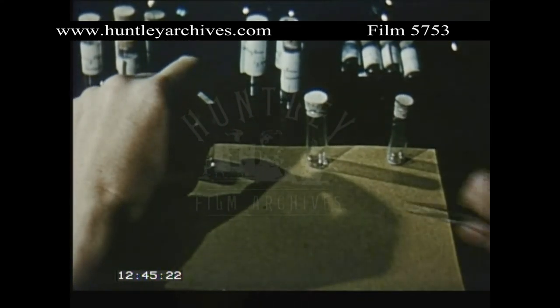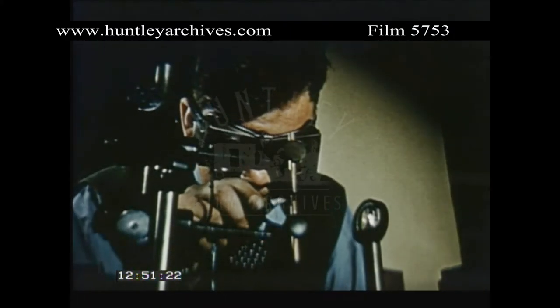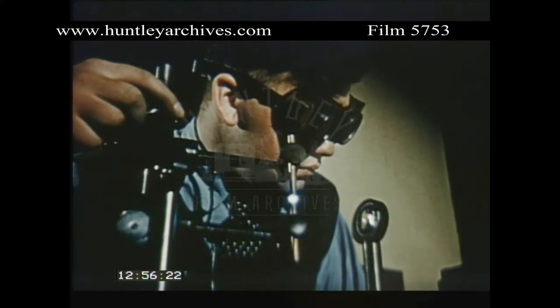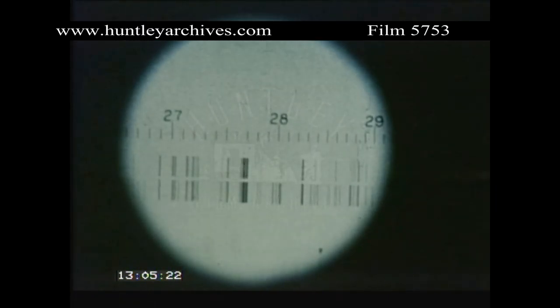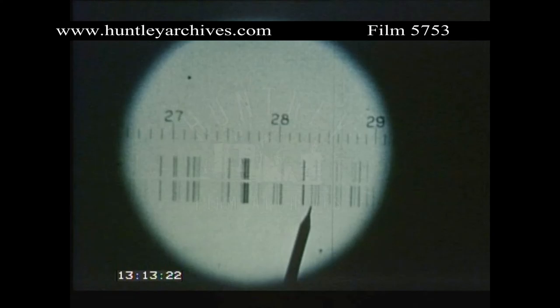Arcs, a convenient way of handling metals, produce good ultraviolet spectra — the region where most characteristic lines are found. Arcs give high sensitivity for qualitative analysis, as in the analysis of these samples of copper for traces of unwanted elements. The resulting spectrogram is projected and enlarged. The upper spectrum is very pure copper, but traces of impurities such as tin, lead and magnesium have contaminated the lower sample.